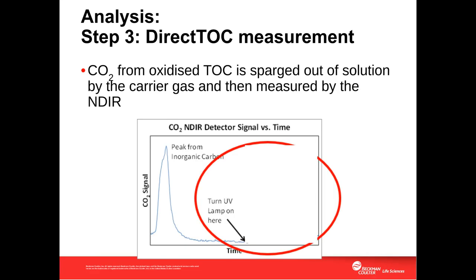In the third analysis step, the carrier gas is used to sweep the CO2 from the oxidized TOC out of solution, and it is then measured by the non-dispersive infrared detector.